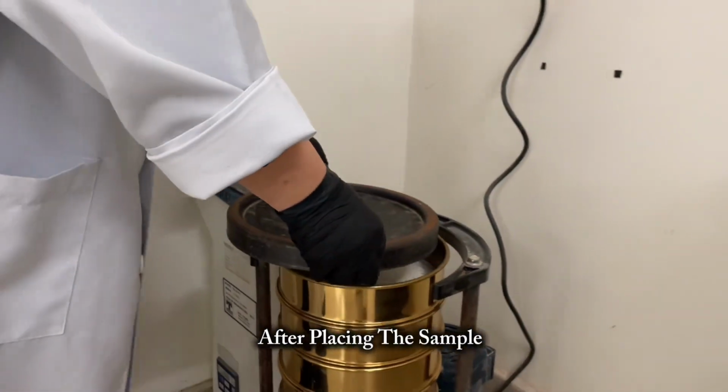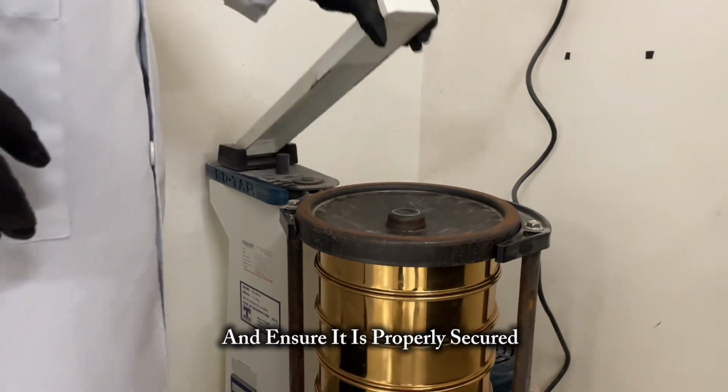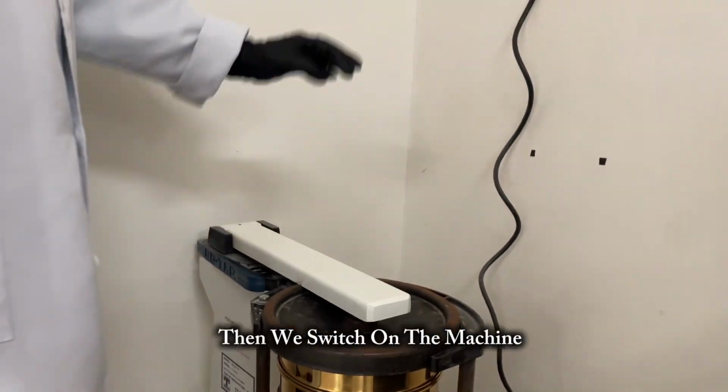After placing the sample, we place the lid on top of the sieve stack and ensure it is properly secured. Then, we switch on the machine.